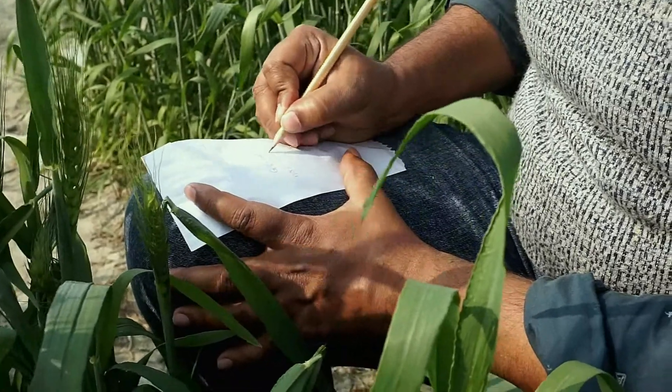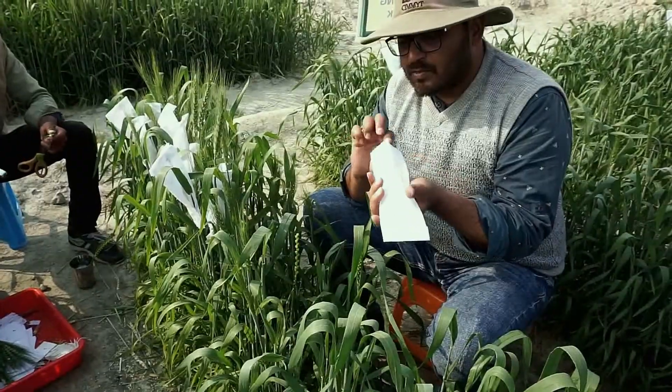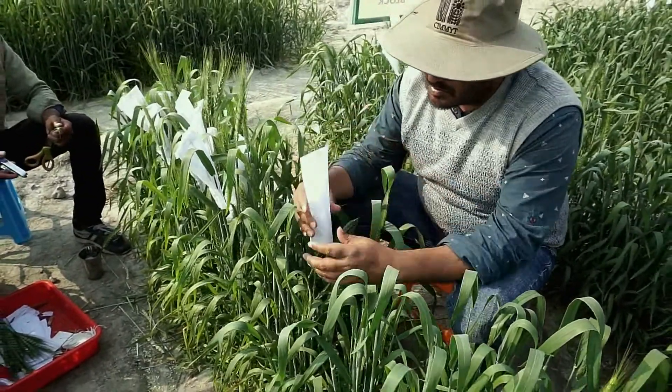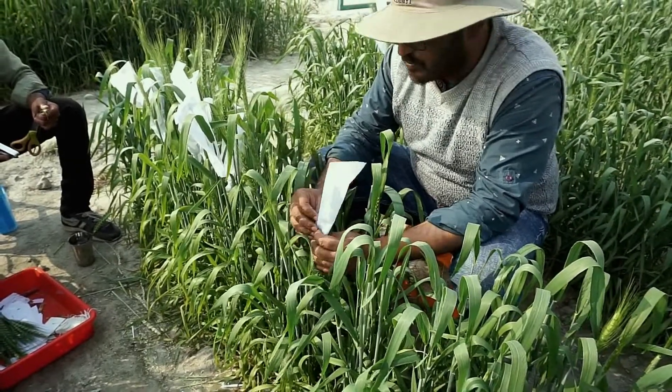After emasculation, cover the spike with a butter paper bag and mention the date of emasculation on it. However, before covering the spike, make sure that all the anthers have been removed from the existing florets.